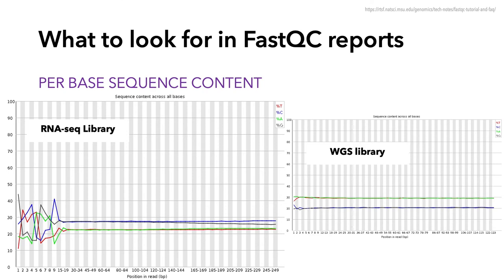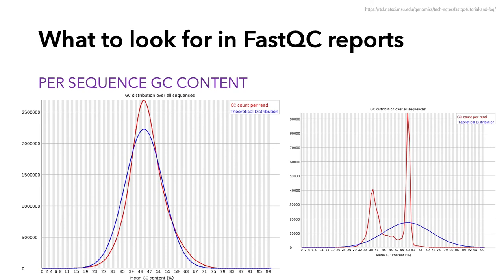The per base sequence content shows the percent of each of the four nucleotides at each position across all the reads in the sample. This is one of those plots that may fail for RNA-seq data even when the sequence is fine. Whereas in whole genome shotgun sequencing you should produce plots that are pretty flat, for RNA-seq data it's pretty common to observe this randomness in the first 10 to 15 bases. The reason is almost always due to primers annealing to the start of the reads during library preparation. This is easy to fix by just cropping out the start of the read — it's normal, nothing to be worried about.